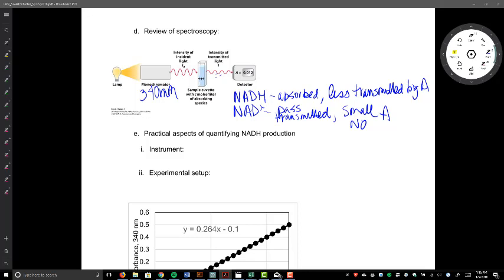And so this would be an instance of 0% transmittance, and this would be an instance of 100% transmittance.